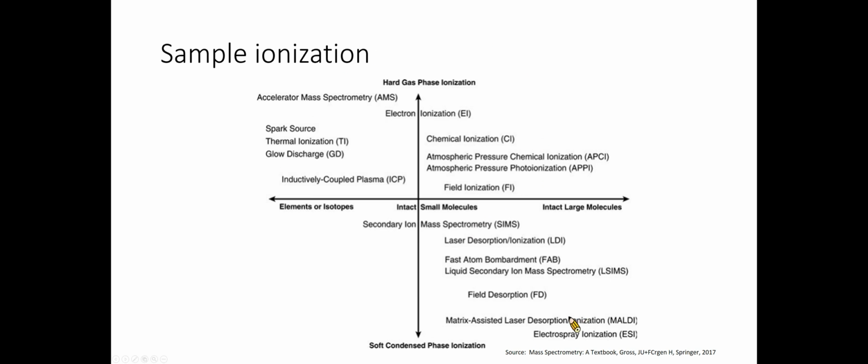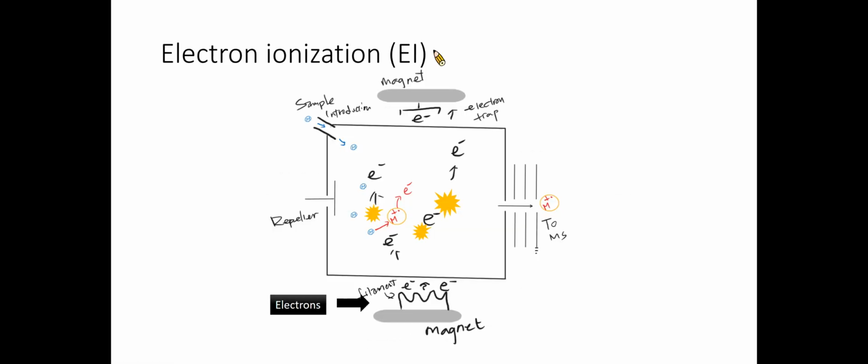This figure illustrates the spectrum of ionization techniques. Electron ionization is an important technique for analyzing low to medium polarity non-ionic organic compounds of molecular weights in the range of up to 800 u, which formerly has been referred to as electron impact ionization or simply electron impact. In electron ionization, energetic electrons are shot onto a gaseous neutral to affect its ionization.